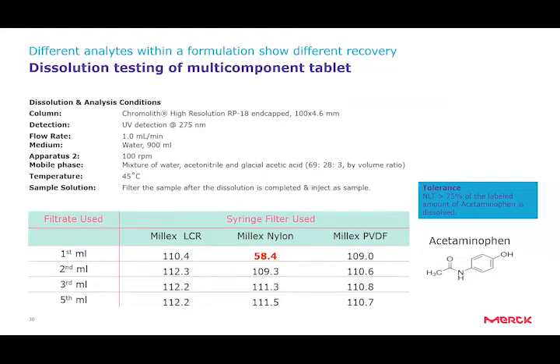We also looked at dissolution testing of a multi-component tablet and filtered the filtrate, following the dissolution test, using either hydrophilic PTFE, nylon, or PVDF membrane. For acetaminophen as one of the components in this formulation, you can clearly see that only 58% of acetaminophen was recovered for the first ml of filtrate, whereas both the hydrophilic PTFE and the PVDF membranes show quantitative recovery.